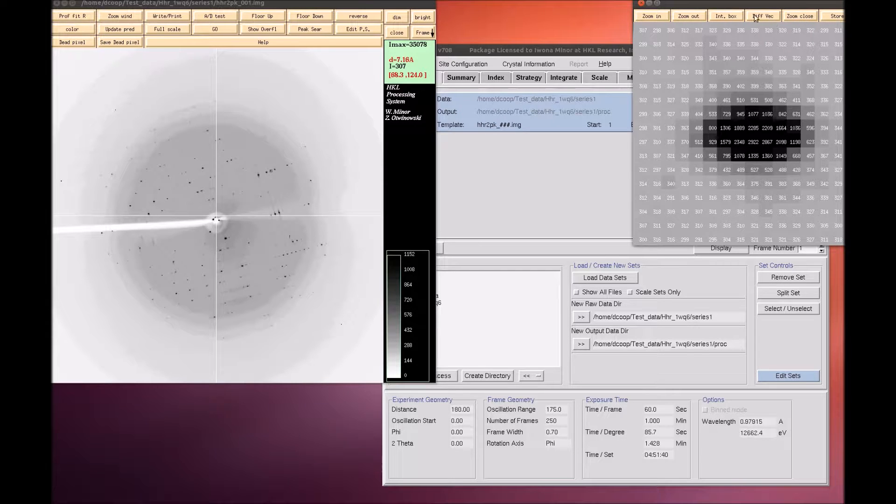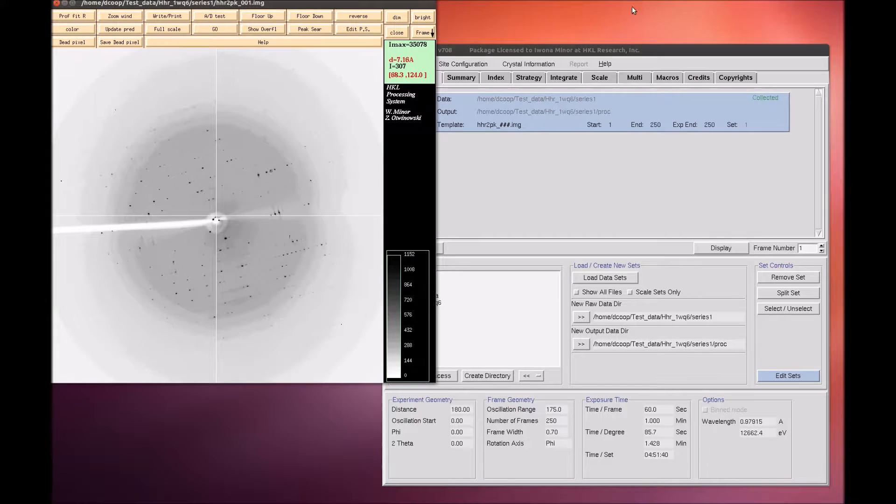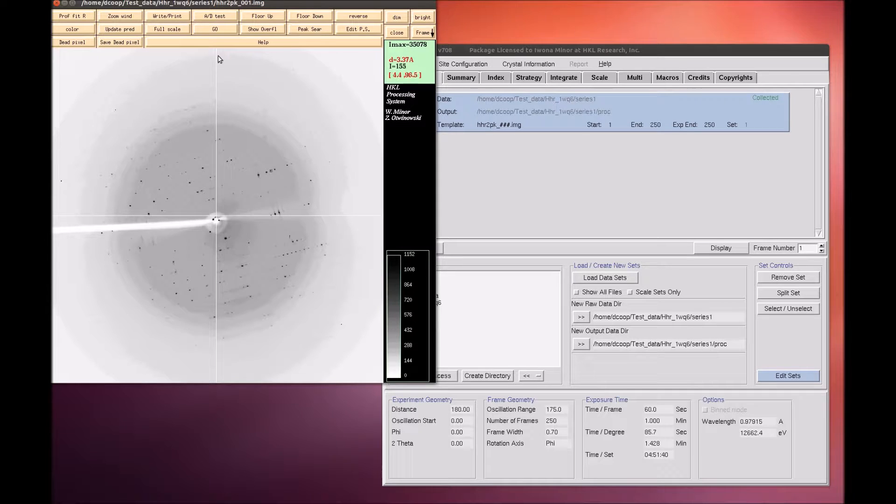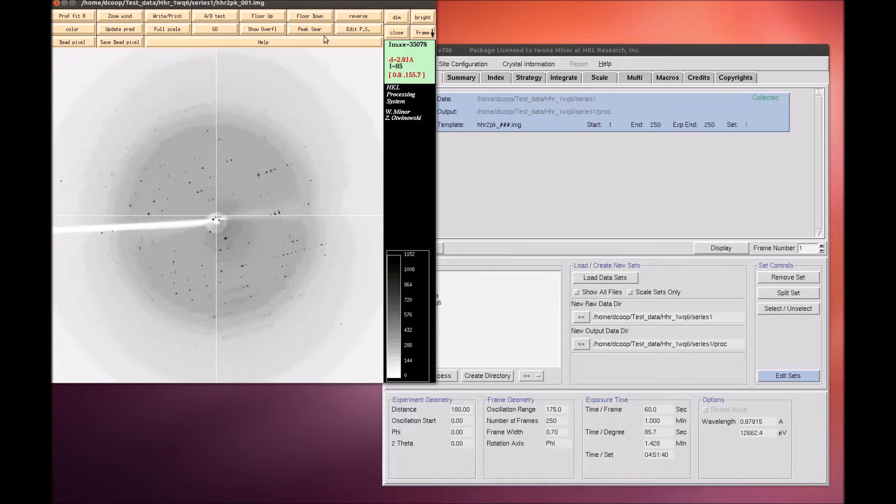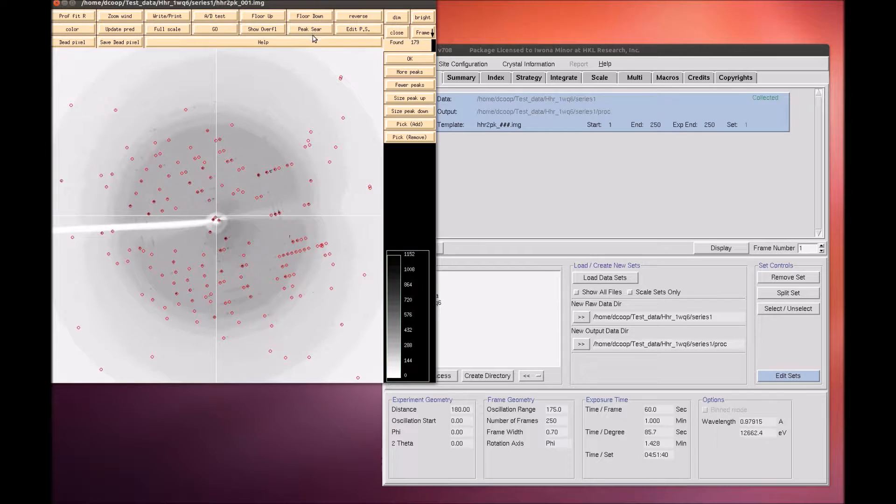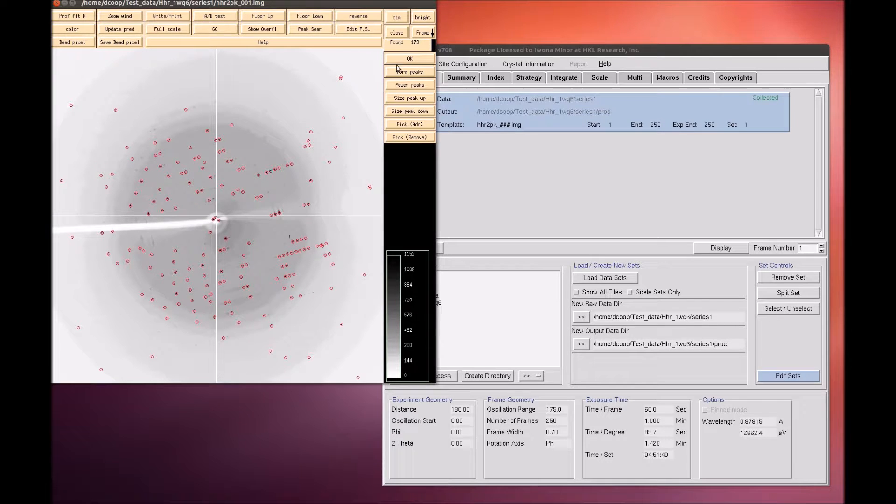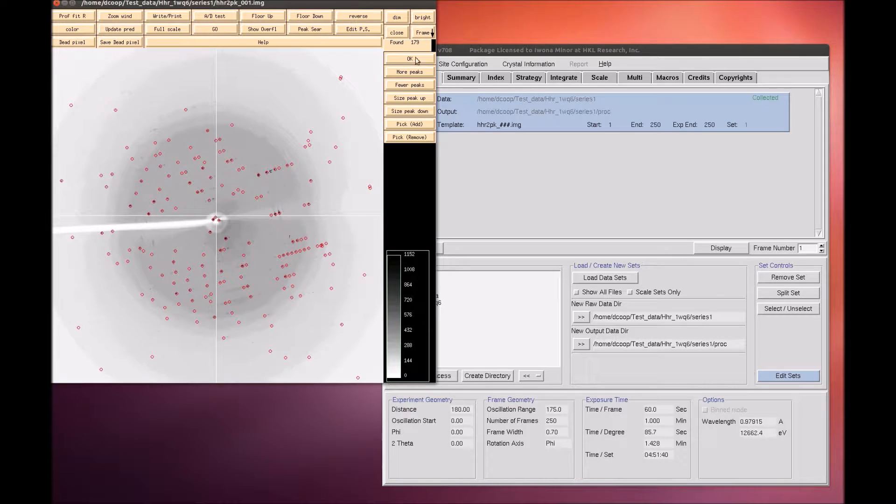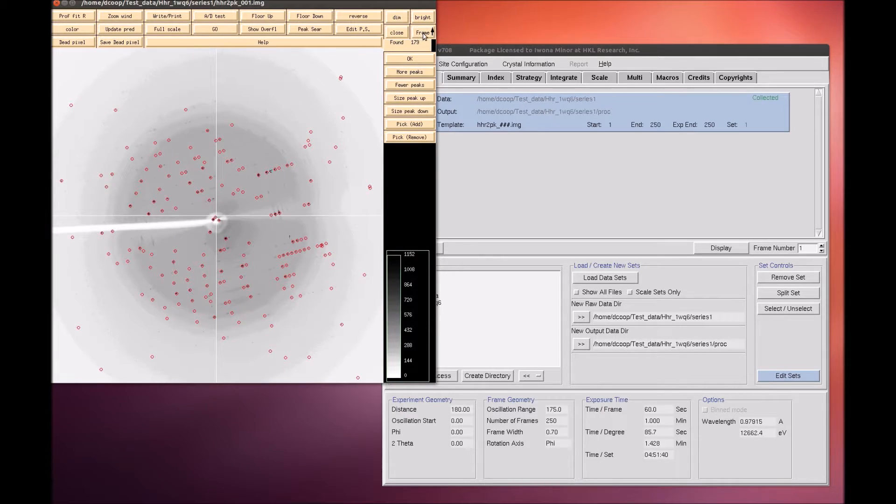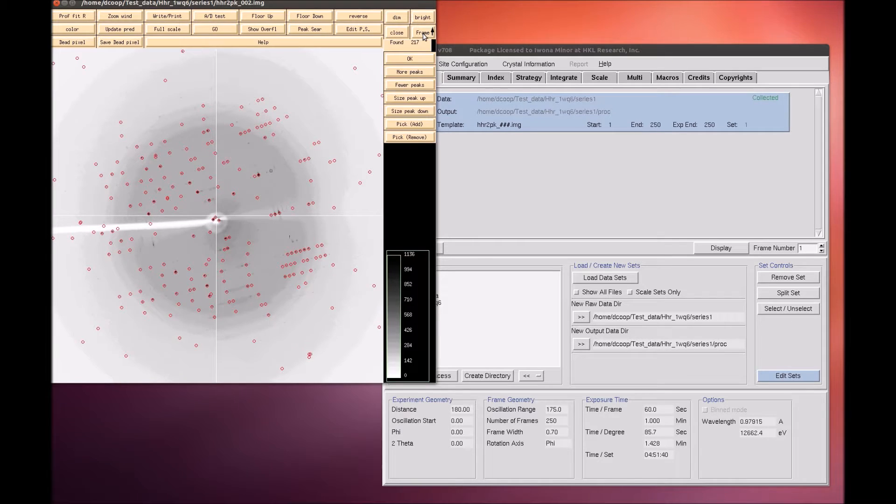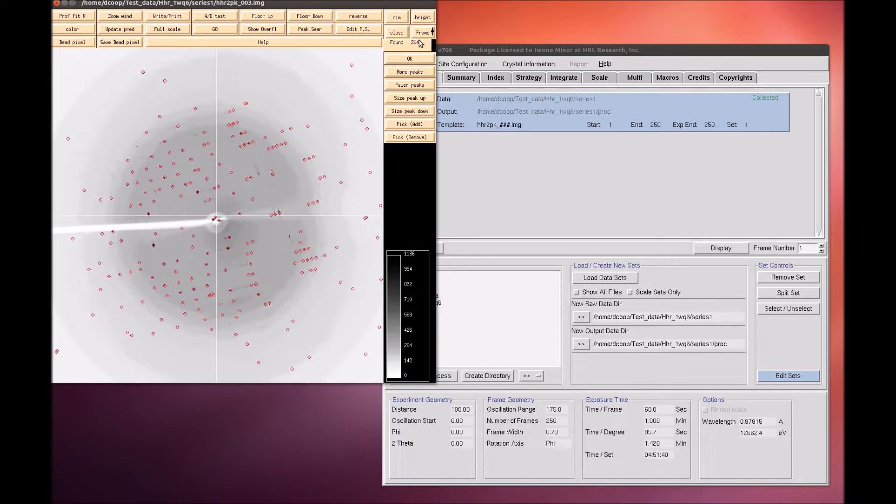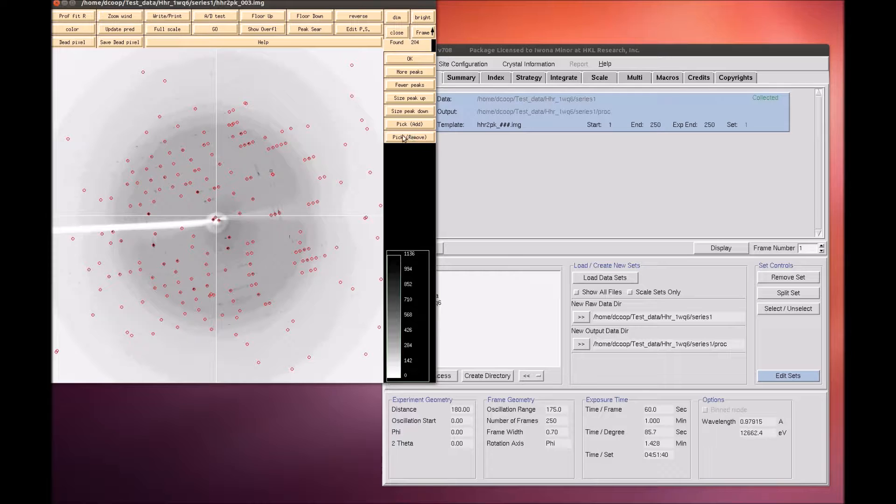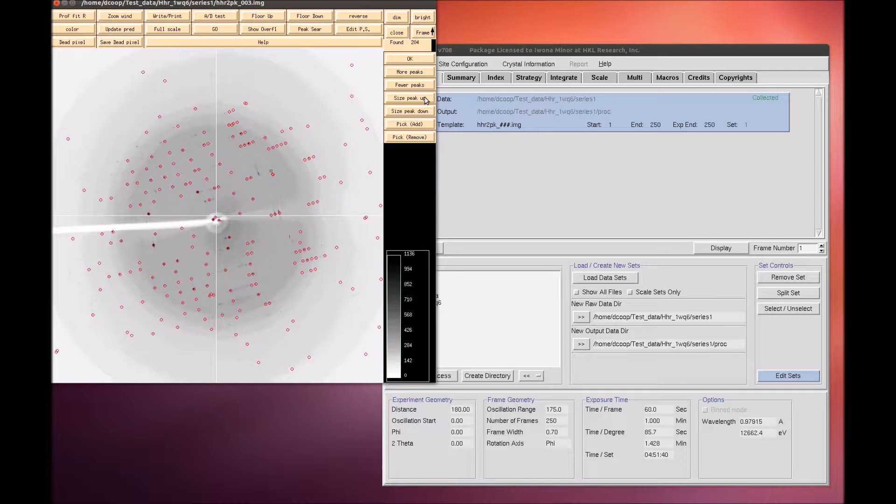The first step of indexing the data is to peak search the data. There are two ways to do this. The first is to select the peak search button at the top of the image display. This opens a dialog on the right that provides ways to alter the number of peaks selected. The Frame button can be used to select peaks on more than one image. The Pick Add and Remove buttons are very useful for weak data or if you need to select one crystal lattice from an image that clearly contains reflections from more than one crystal. Click OK when you are done.